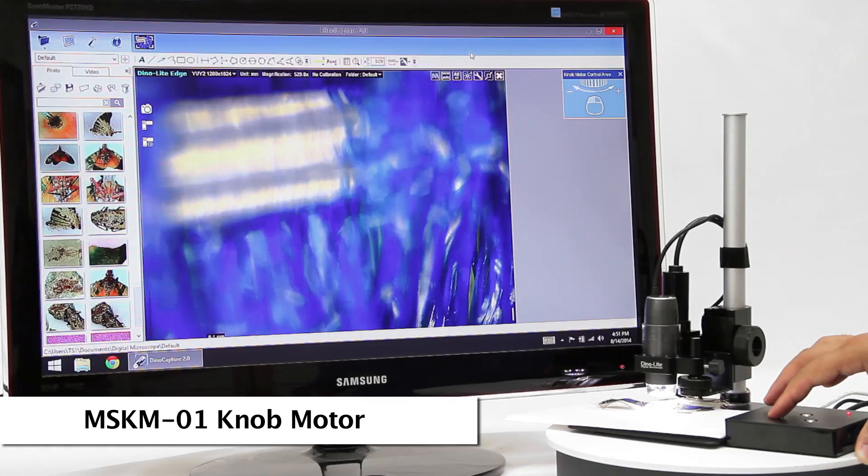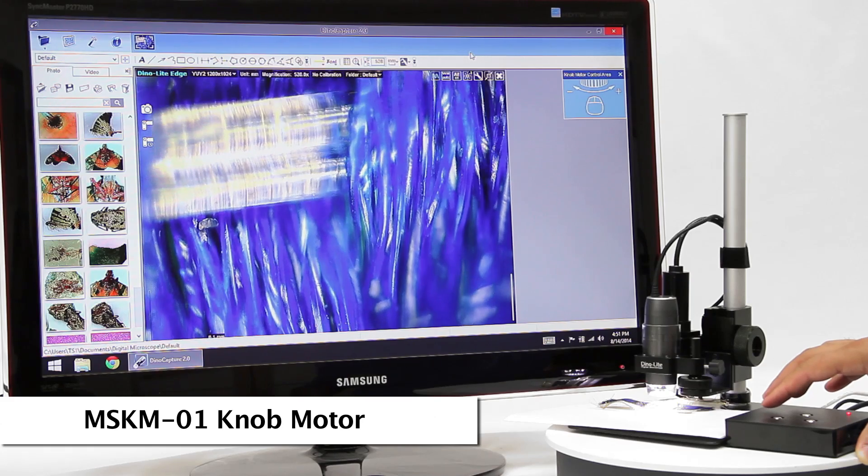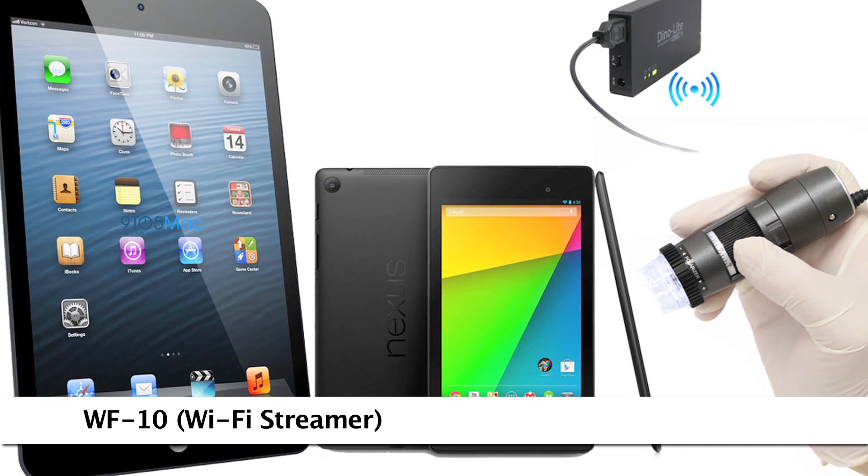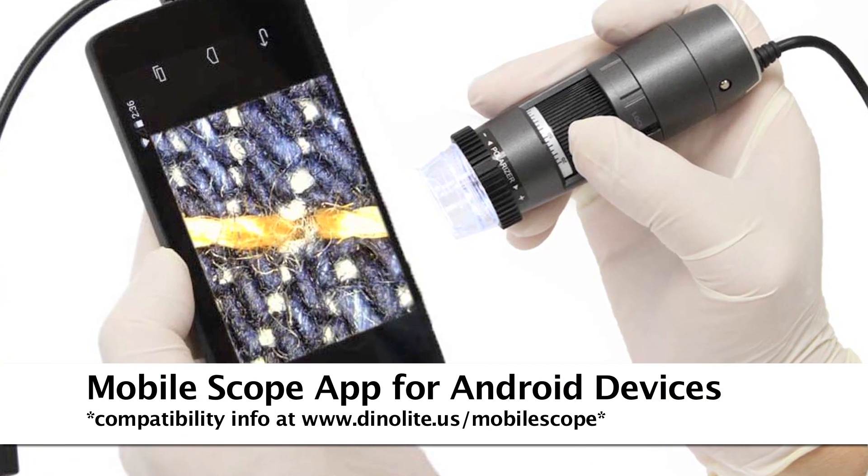The DynoLight knob motor provides remote controlled precise movement which is very helpful for viewing at higher magnifications. There are also options for mobile viewing including a Wi-Fi adapter and a direct connect option to compatible Android devices.